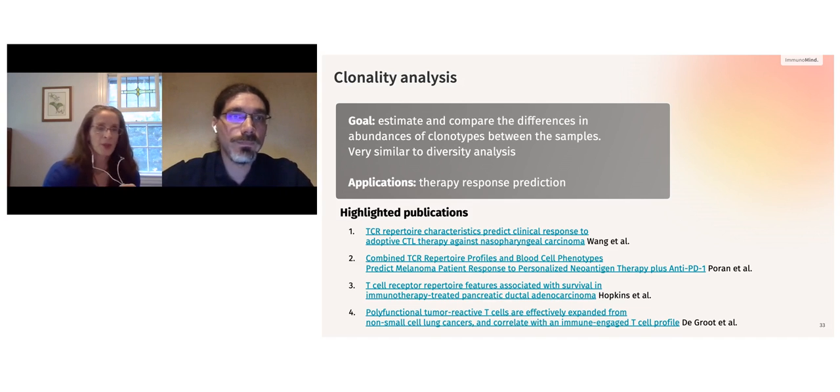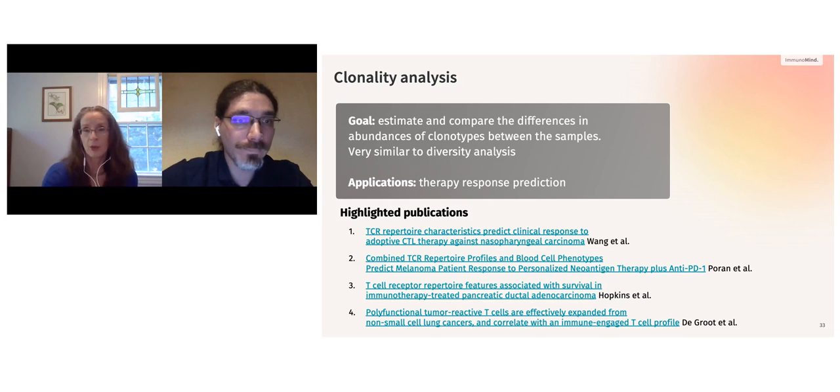Thanks very much. And I will just read the first part of this because it is, hi, very useful presentation. Thank you very much. And then the question is, can you compare your platform in comparison to IMGT HighV-QUEST? And is it available for academics?